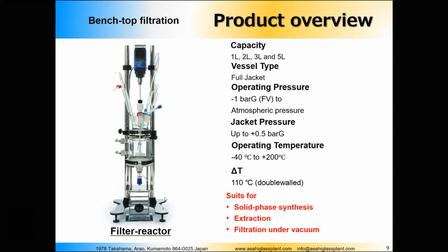So that's how the solid phase synthesis is done. I do hope that I explained it pretty clearly, and as I told you, you can easily get in touch with us, and we can talk about this in more detail, about the automation of this process, how you can control that, and so on and so forth. There are different kinds of equipment for that.